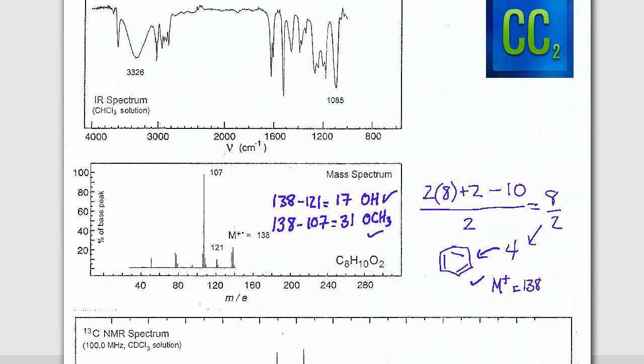But we want to verify it. So we're pretty much done with mass spec at this point. We're going to go on and verify through other spectroscopy. So you can see the pacing here and how much time I'm spending in each region. So I'm already nailing down some important parts. However, it's going to likely come down to looking at the IR and then really looking at the NMR is what's going to sort of tie everything together.